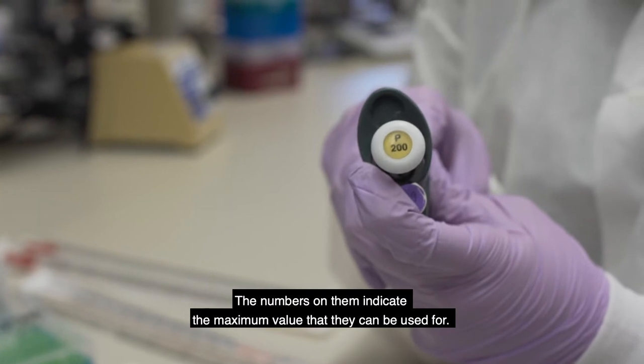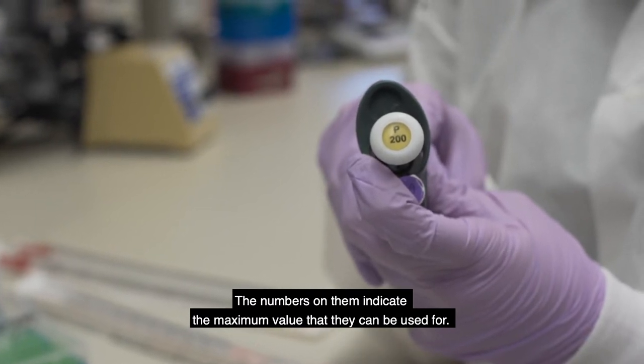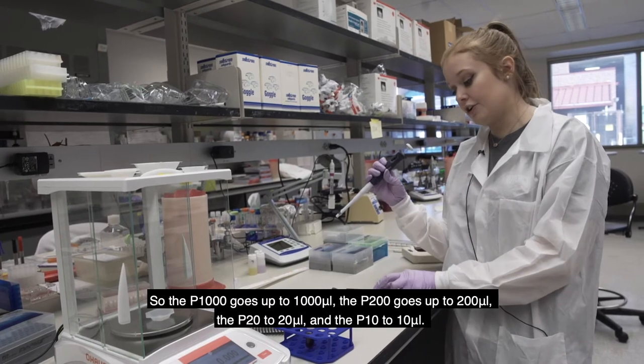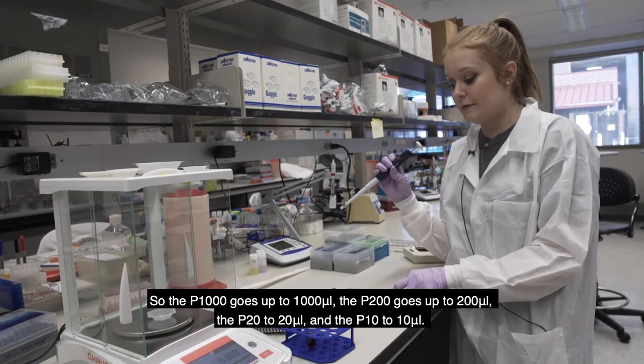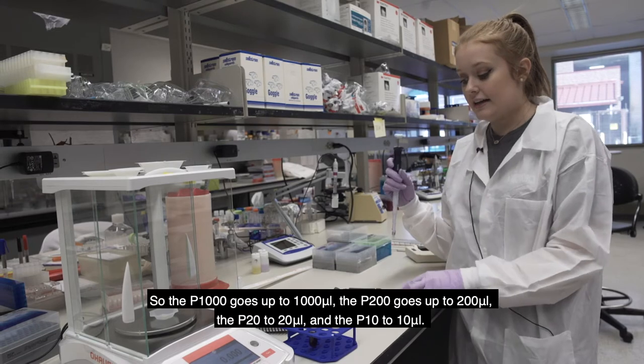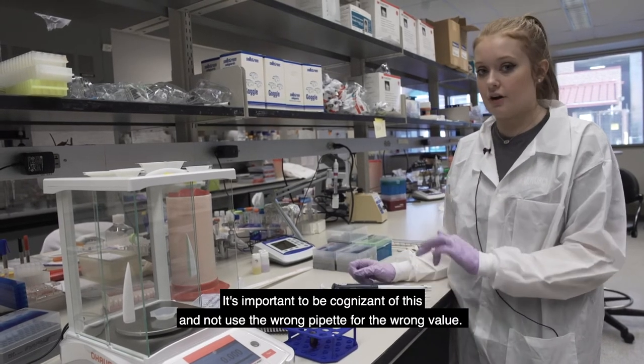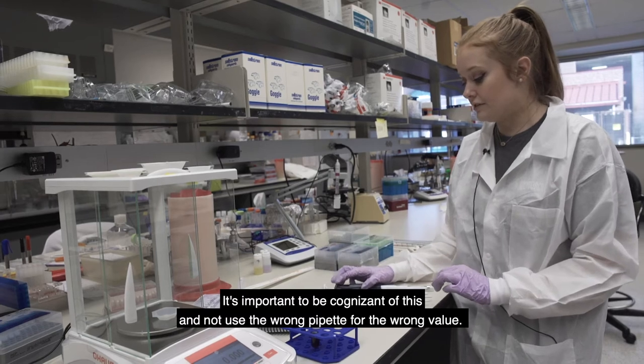And the numbers on them indicate the maximum value that they can be used for. So the P1000 goes up to 1000 microliters, the P200 goes up to 200 microliters, the P20 to 20, and then the P10 to 10. So it's important to be cognizant of this and not use the wrong pipette for the wrong value.